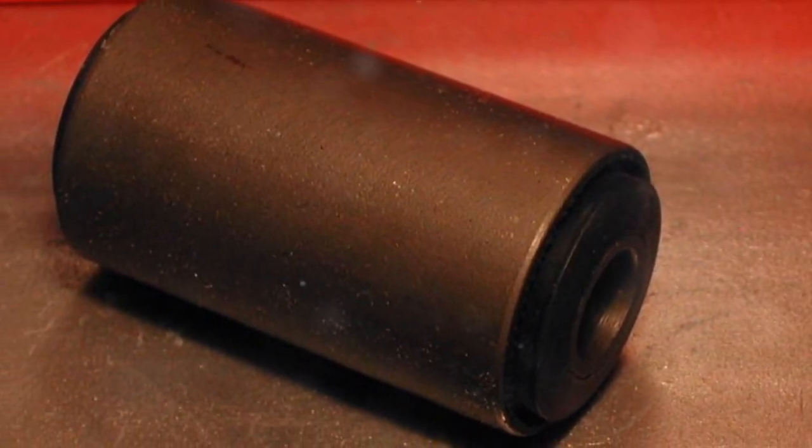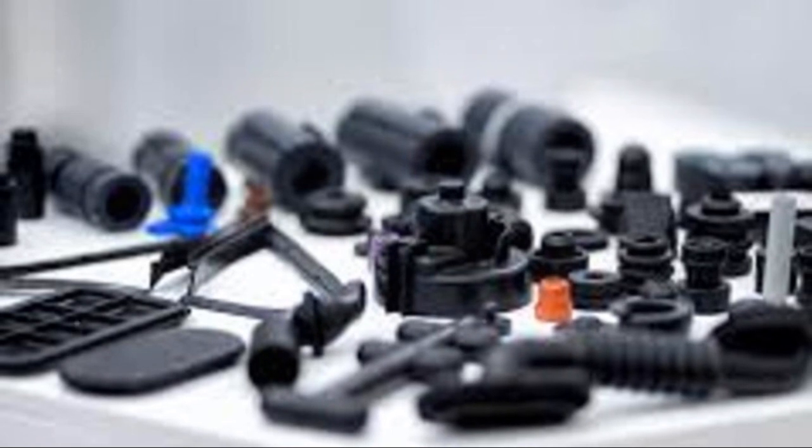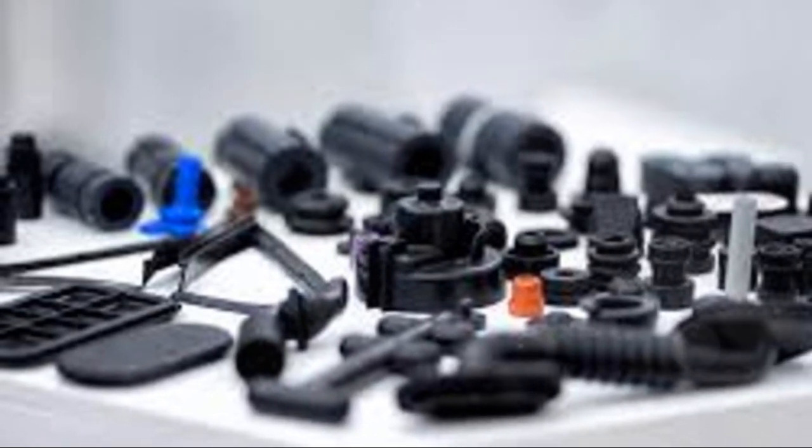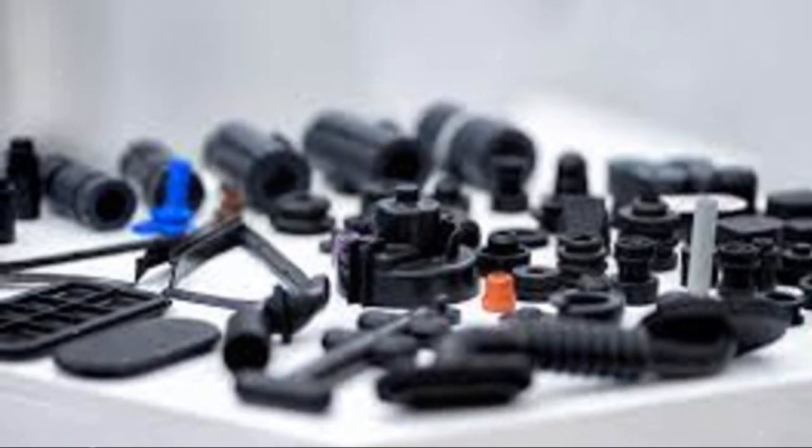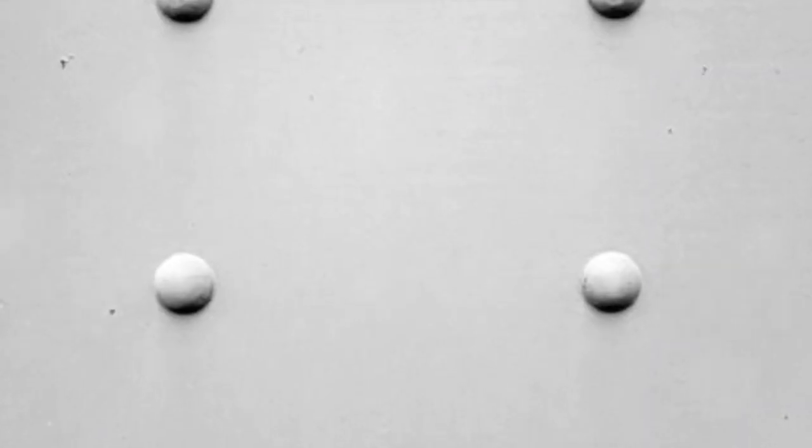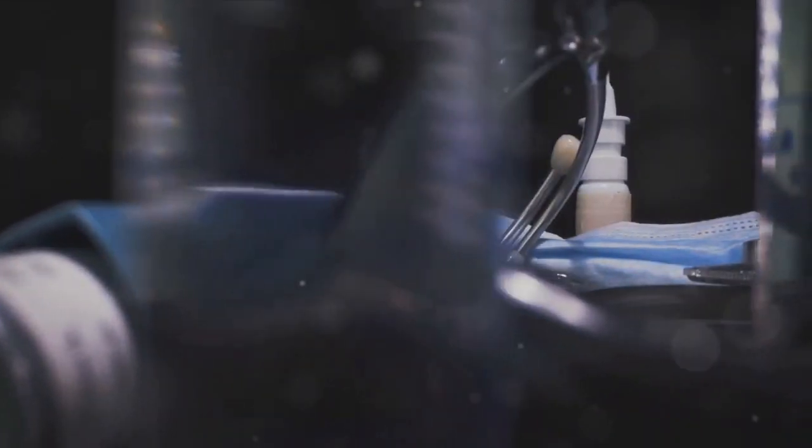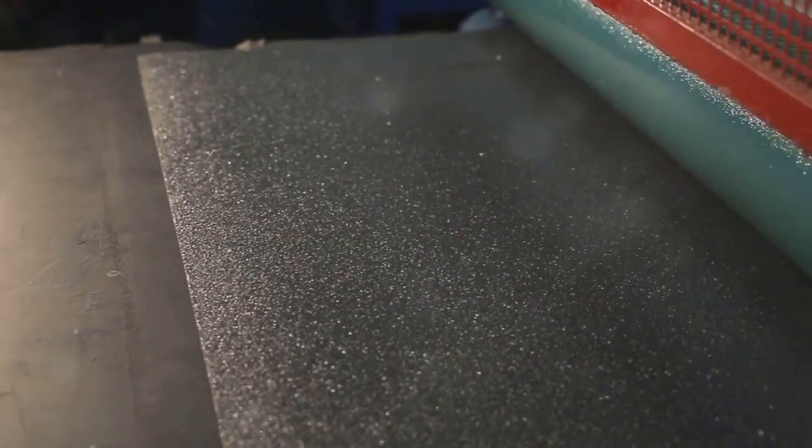First up, we have method A, where a rubber part is assembled between two parallel metal plates. This method is straightforward, allowing for direct testing of the rubber's adhesion to the metal.